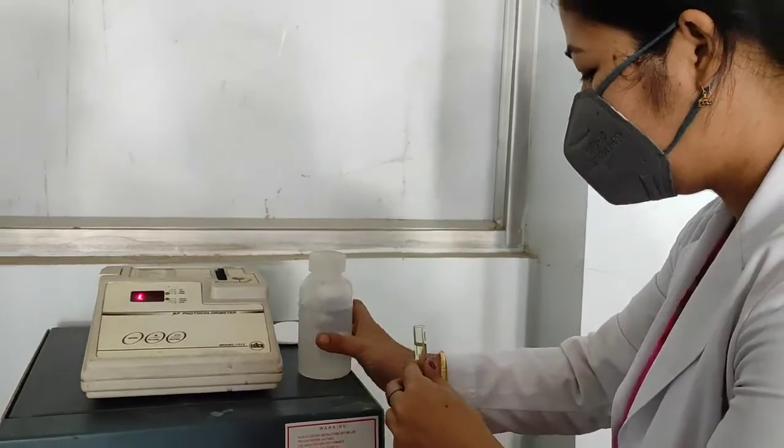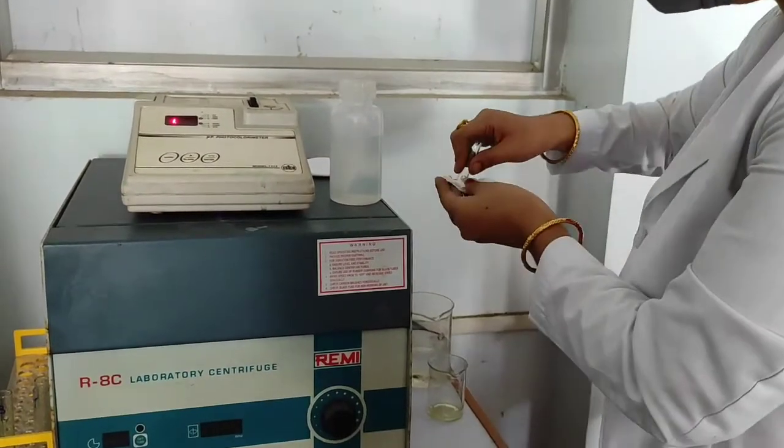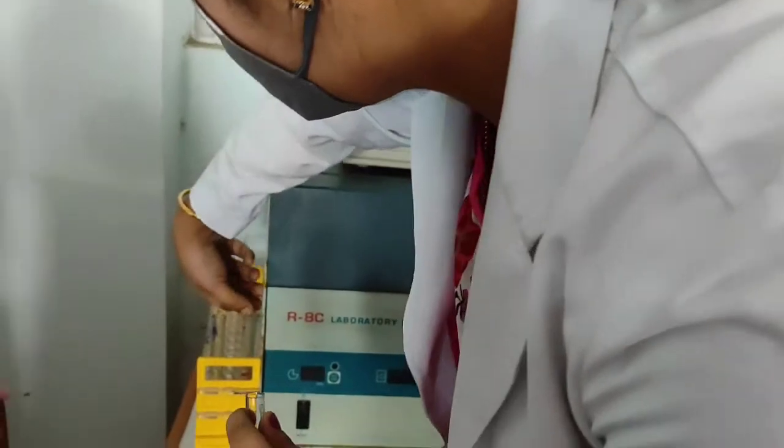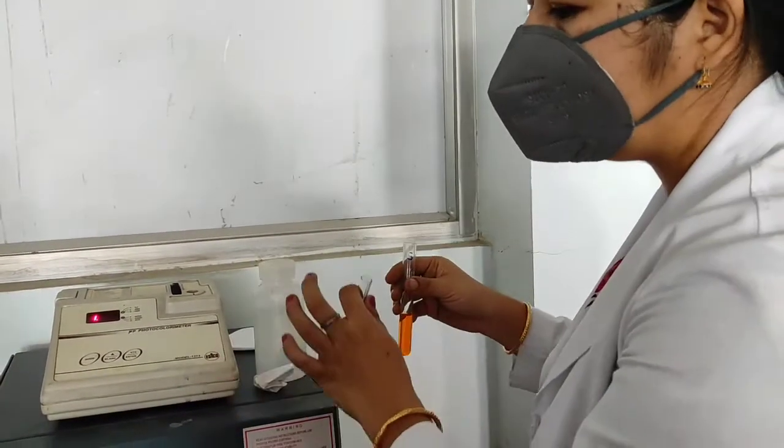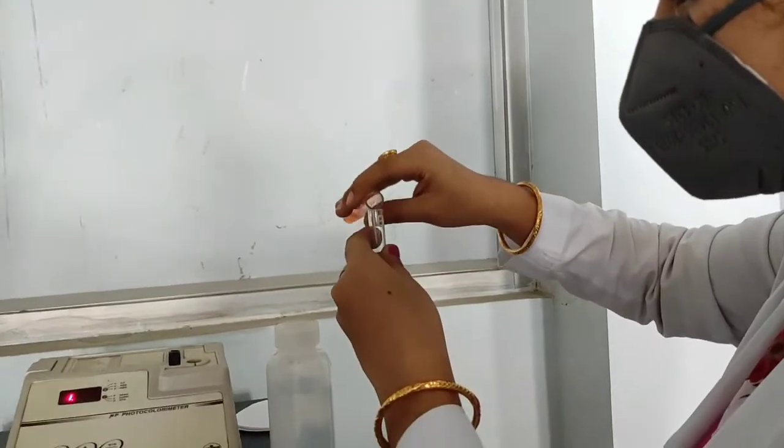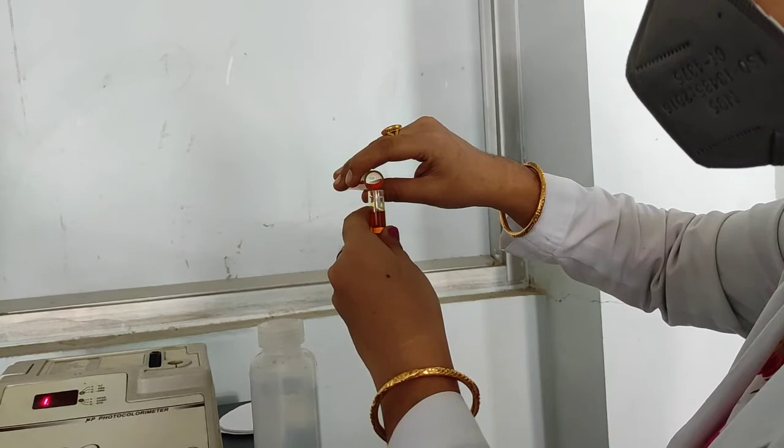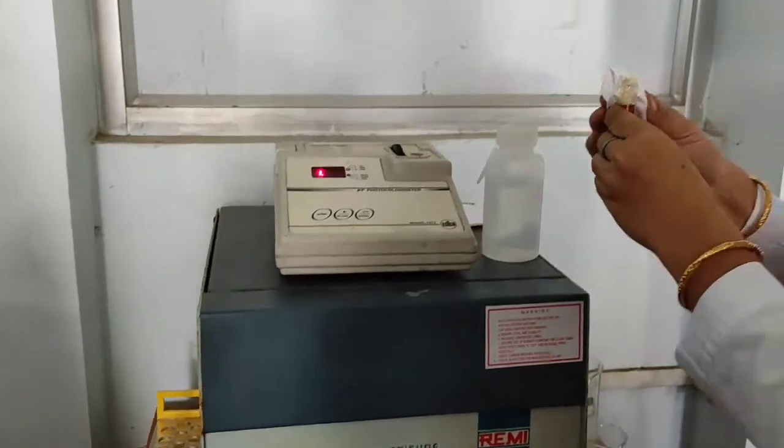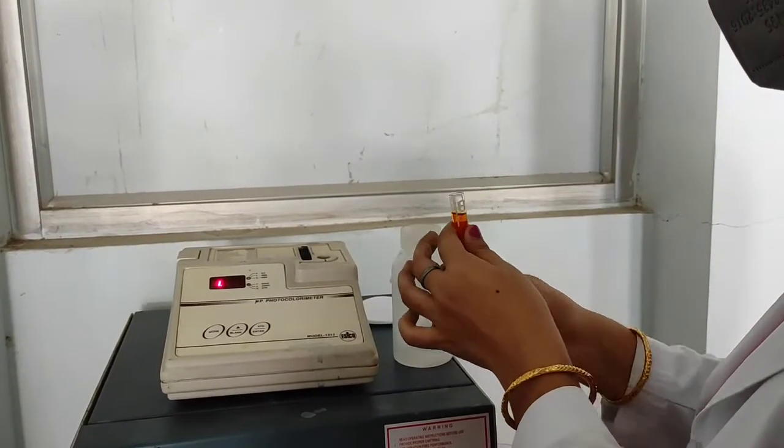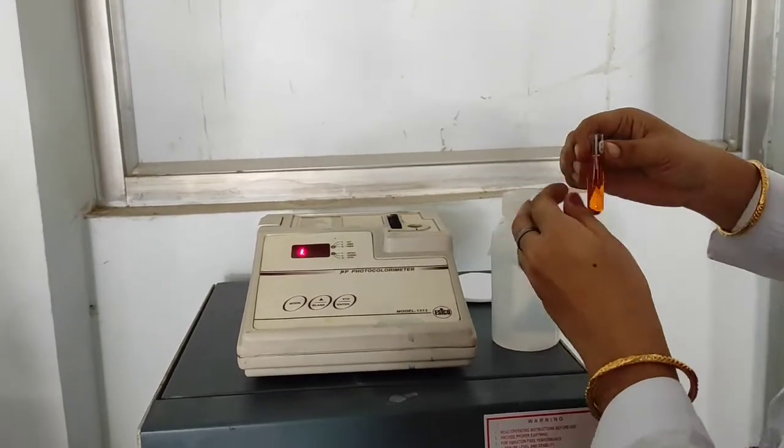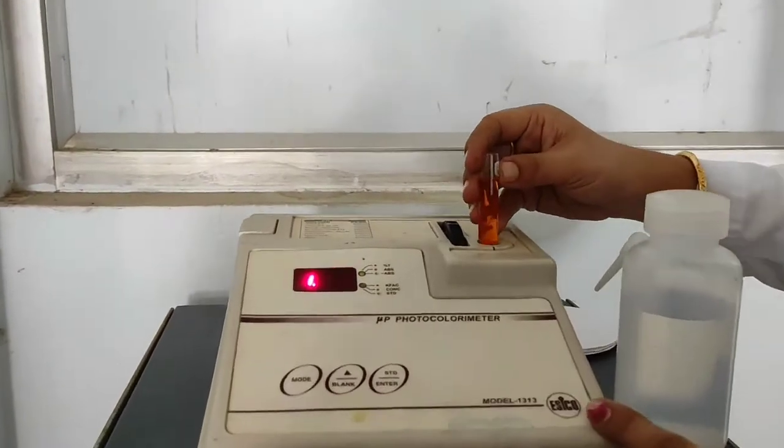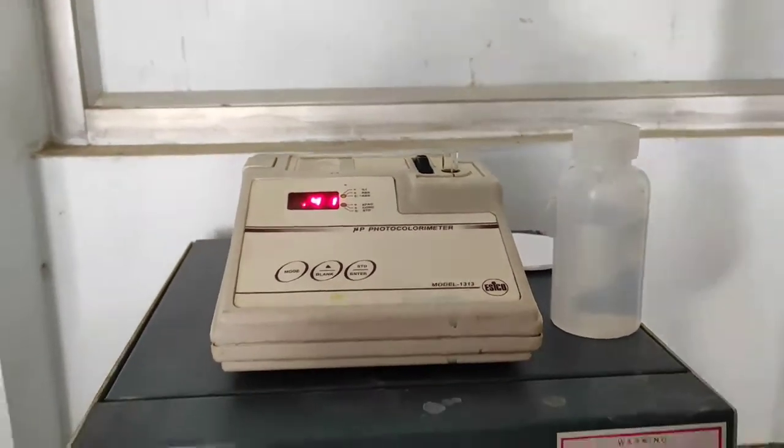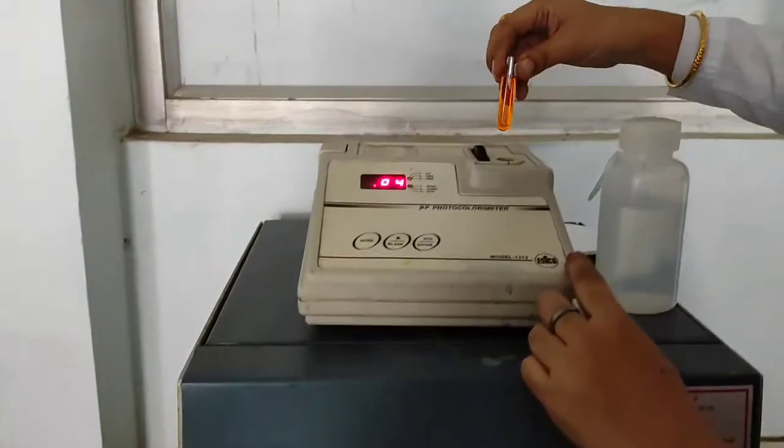The next one is the standard. The sequence would be blank, standard, and then test. This is it. 0.41, the optical density of the standard.